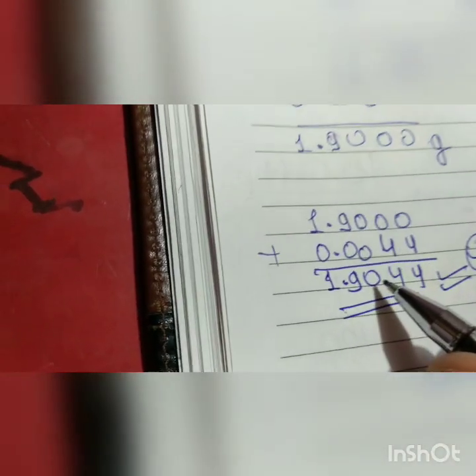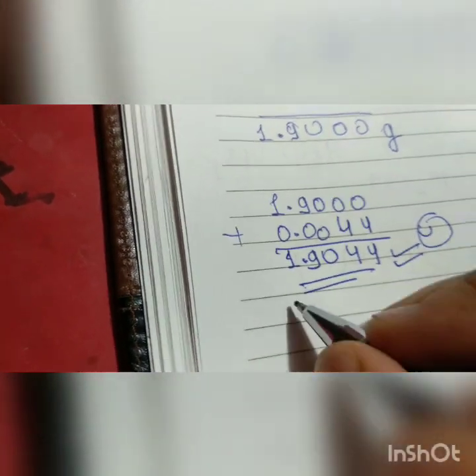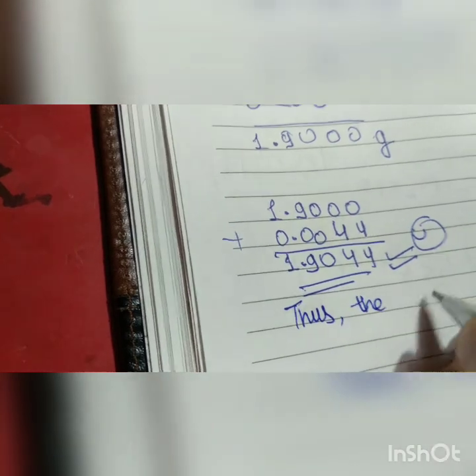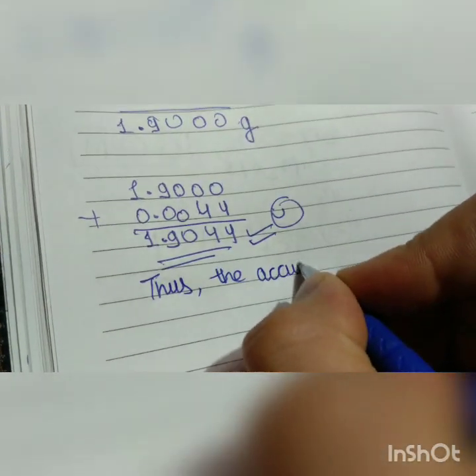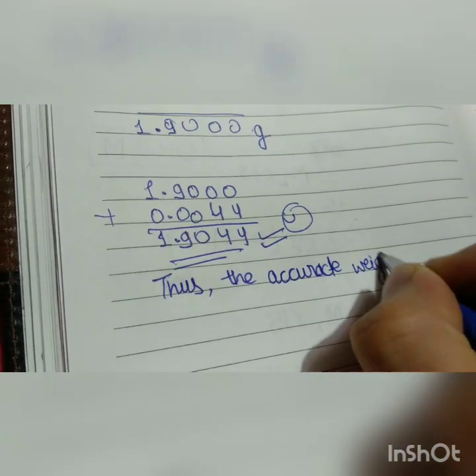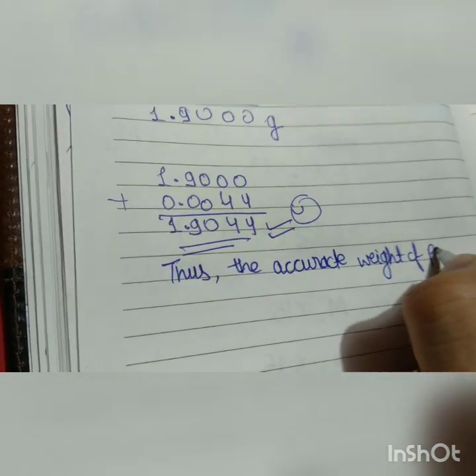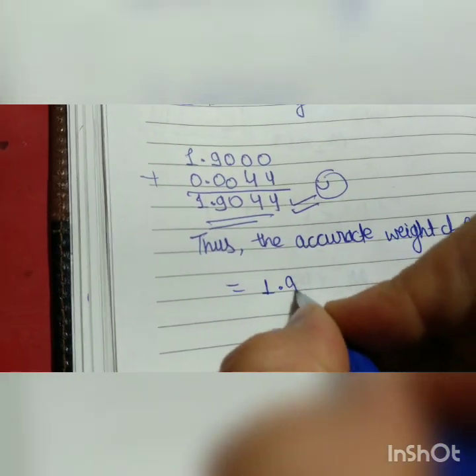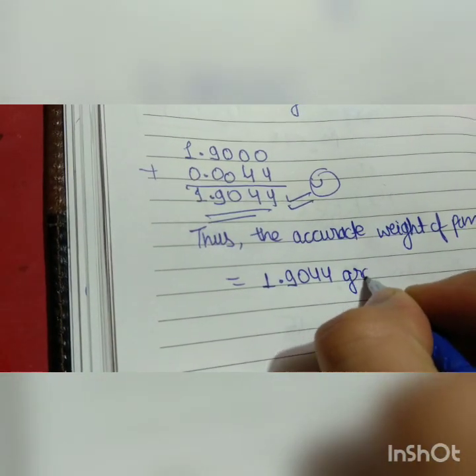Now add this: 1.9044. And this is our correct weight. You can see 1.9044. Thus the accurate weight is 1.9044 grams, equals 1.9044 grams.